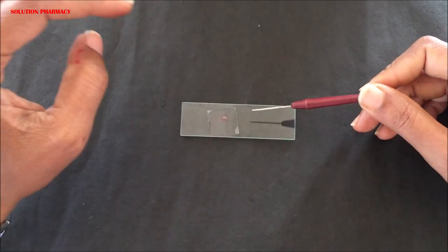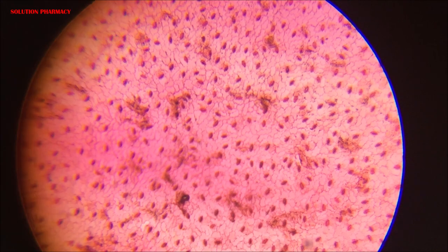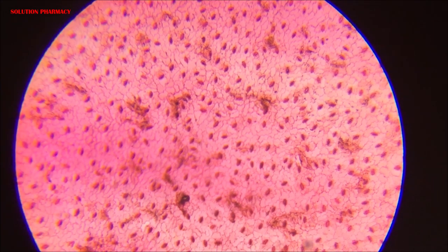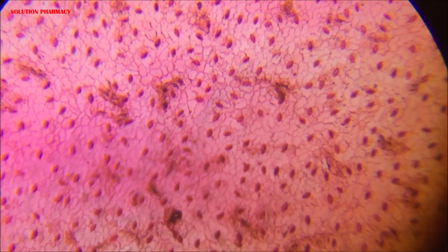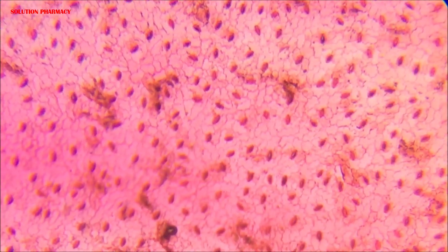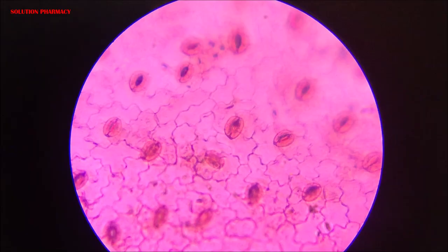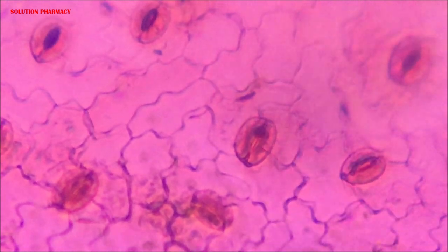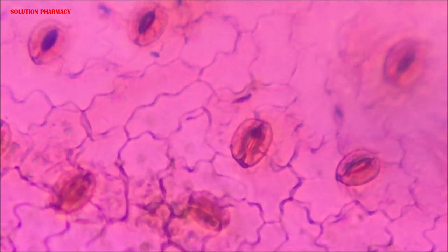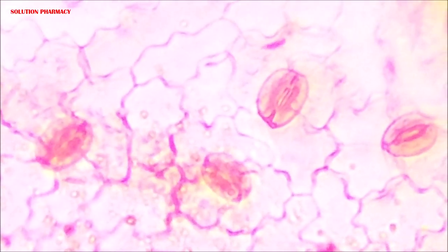The slide is now ready to observe under the microscope. We are observing the epidermal layer at 100x magnification — 10x objective lens and 10x eyepiece of a compound microscope. You can clearly see a number of small pores scattered between the epidermal cells; these are called stomata. Observing the same slide at 45x objective lens and 10x eyepiece, you can clearly see the stomata embedded between the epidermal cells, through which gaseous exchange takes place in the plant.